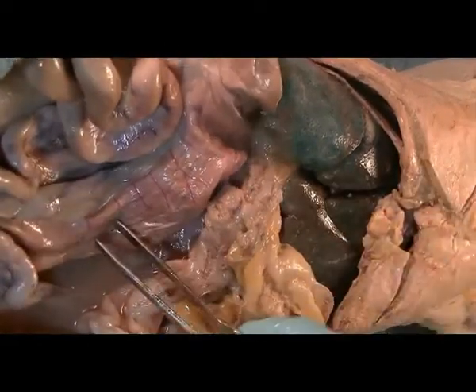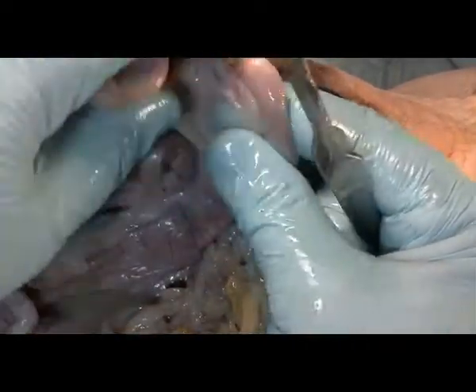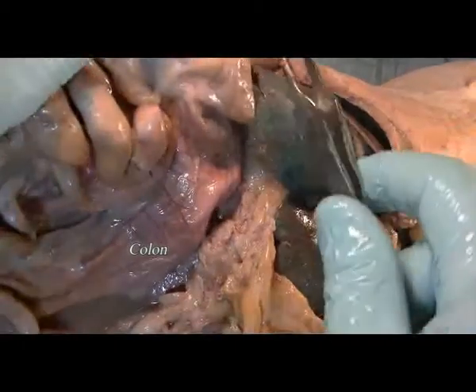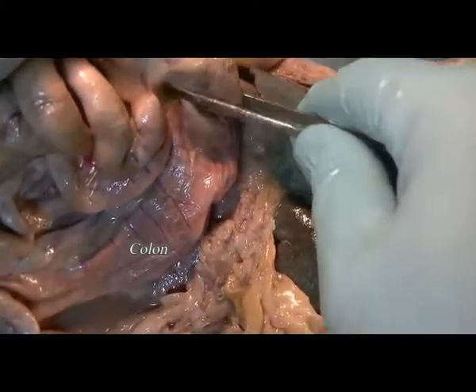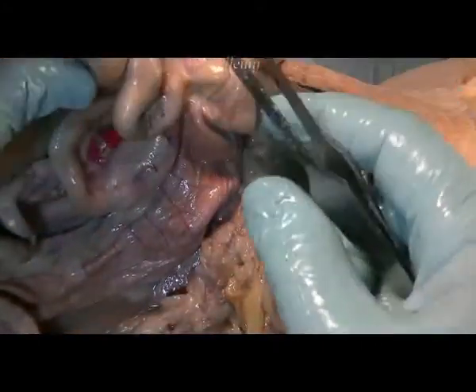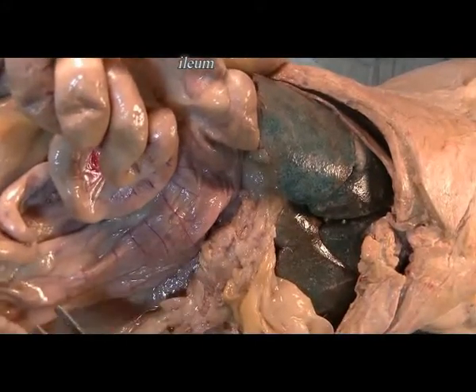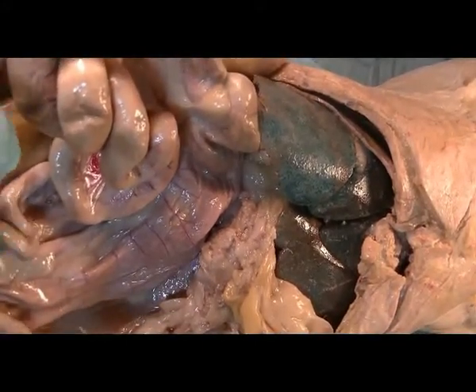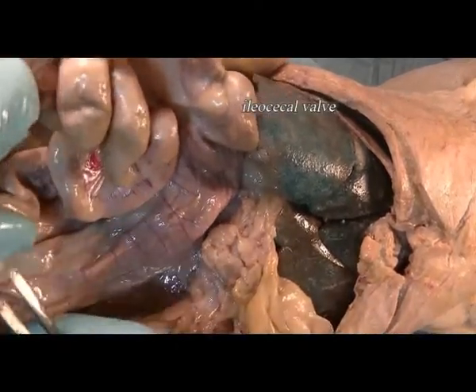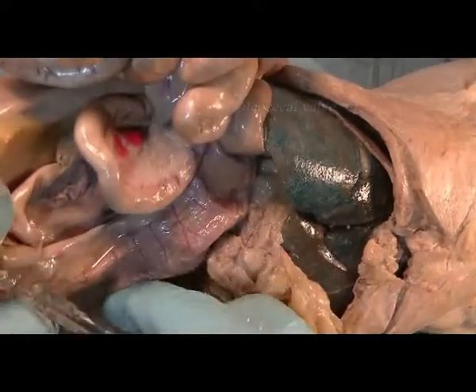Let's see if I can find a nice, oh, here we go. So here's the colon. And the jejunum is the curly part, but the distal part of it is the ileum. And there's a valve here called the ileocecal valve, which separates the large intestine from the small intestine. And in humans, you have the ascending, transverse, and descending colon, but we don't make that distinction in cats.